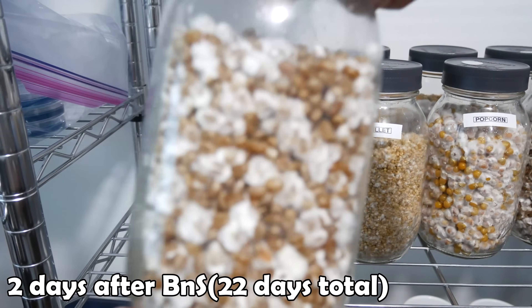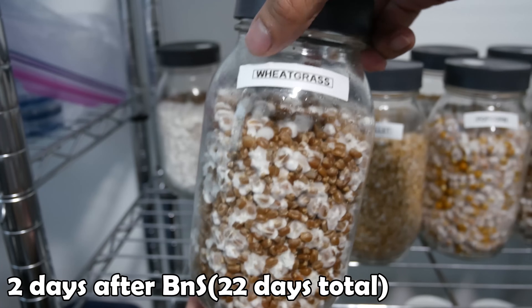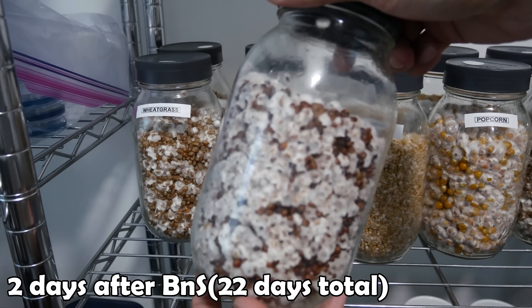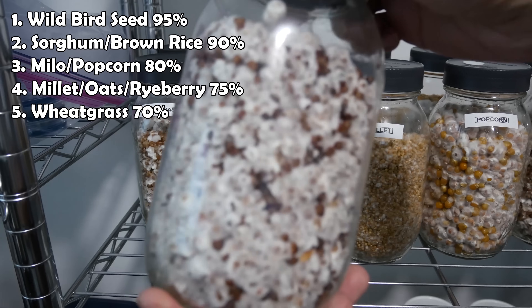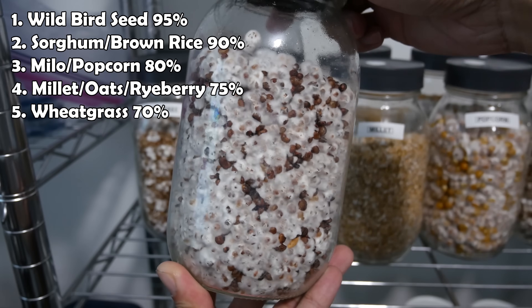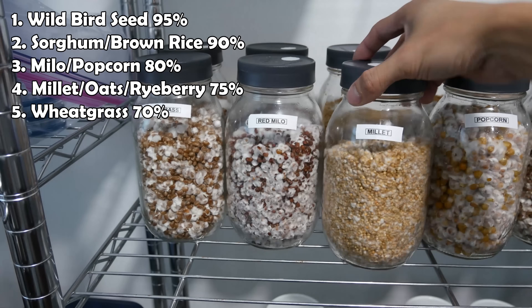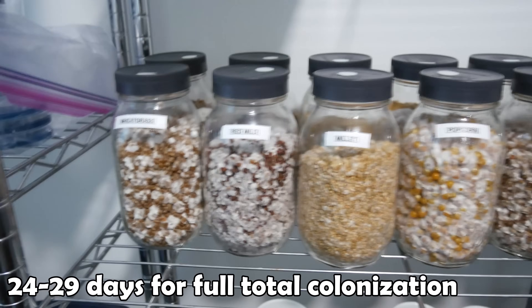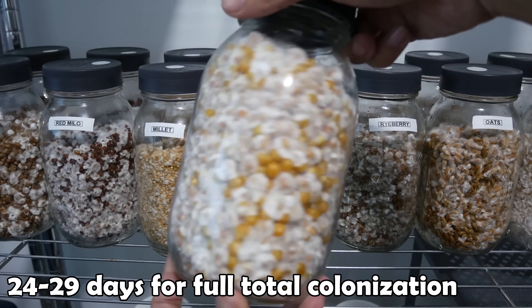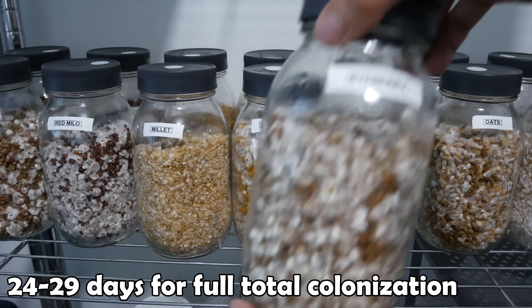At the 20-day mark, I decided to break and shake the front jars. In a real situation, this would probably be the fastest way to get full colonization. I wanted to see how quickly the mycelium recovered and worked their way back to being fully colonized. After the break and shake process, mycelium continued to colonize quickly. The colonization speed was as follows: wild bird seed was the fastest, followed by sorghum and brown rice, and millet and popcorn were a close third. Millet, oats, and rye berry were about 75% fully colonized, and last place was wheatgrass at around 70% — these are all estimations based on visually inspecting the jars. After 24 days total we had full colonization on the wild bird seed jar, then sorghum, then brown rice. At the 29-day mark, pretty much all the jars were fully colonized. I then broke and shook the rest of the back jars because I wanted to use both jars for grain spawn. I let these consolidate for a few days and then spawned them all out.